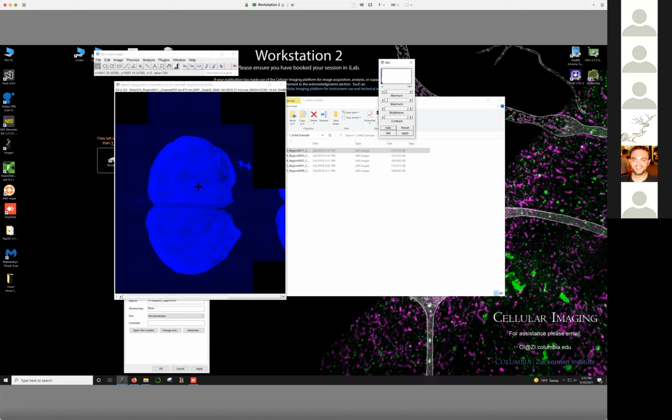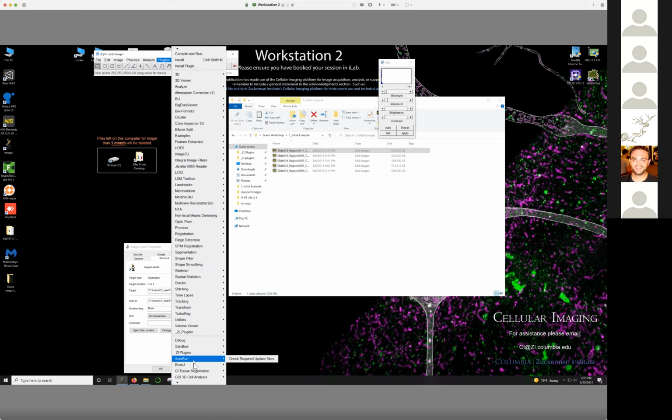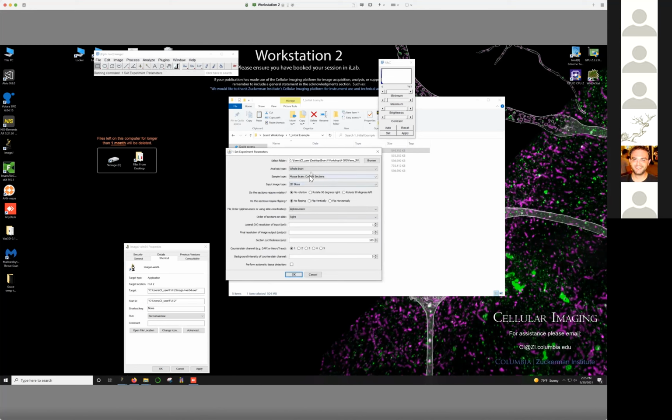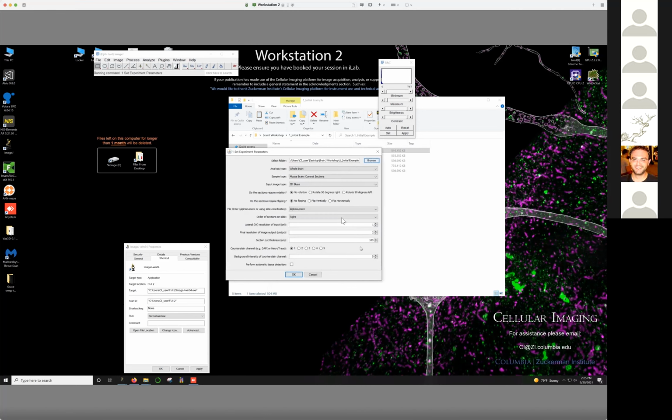And you can see we need to rotate this to the right. So those are the 2 things I need to know there. So I'm just going to go back. I'm going to go into BrainJ. Okay, so I'm just going to choose the directory. This is all fine. We need to rotate to the right. We don't need to flip. This is fine. Our counterstain channel is 3, and for the background, we can just say 230 here.